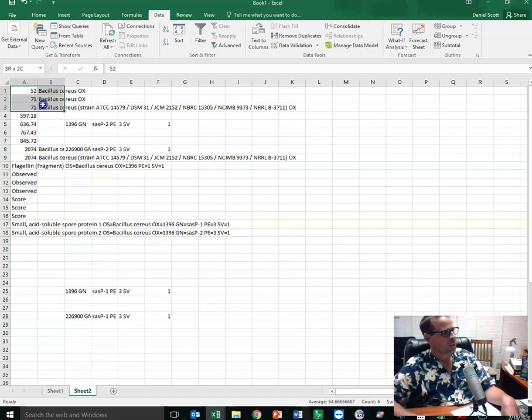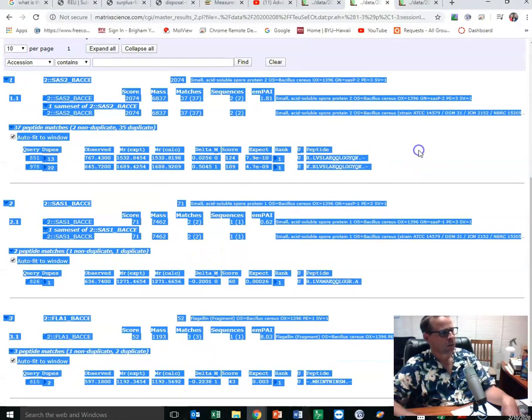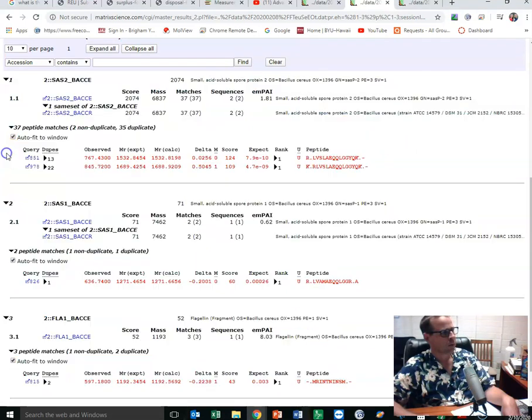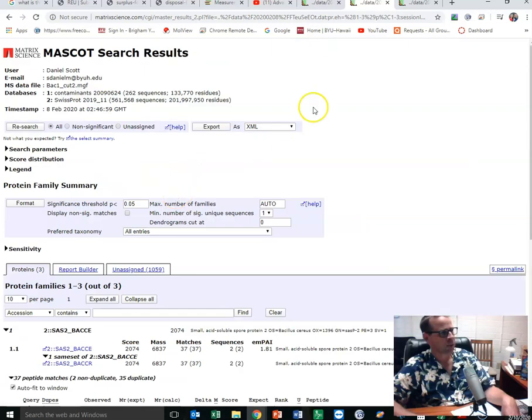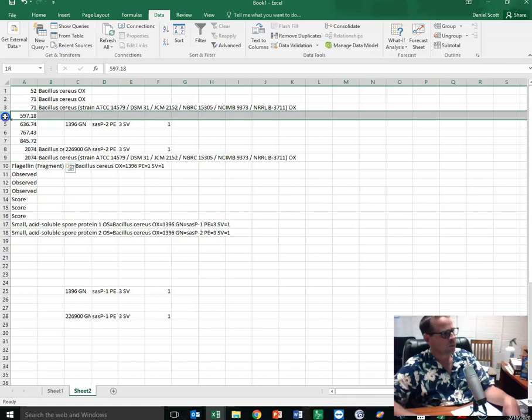It's showing me only 1, 2, 3, 4, 5 hits. Did I lose some data there? Let's double check that that worked. So here we had 2 hits here, 3, 4 hits here, and then 5 hits. Yeah, so that was right. So it's just the 5 hits. So we didn't lose data, but now we can again identify the regions that we don't want.